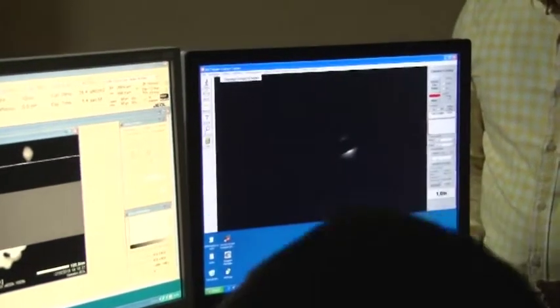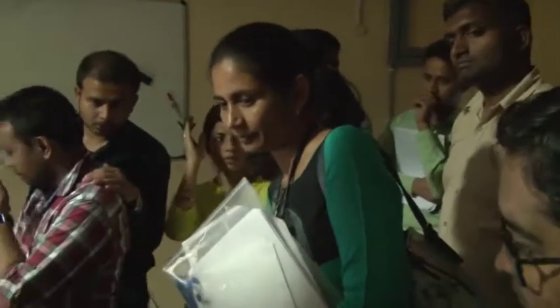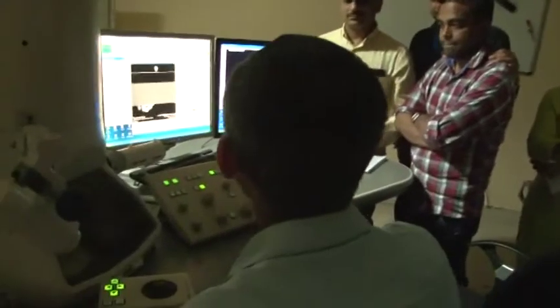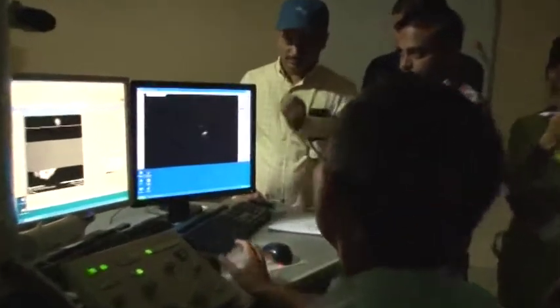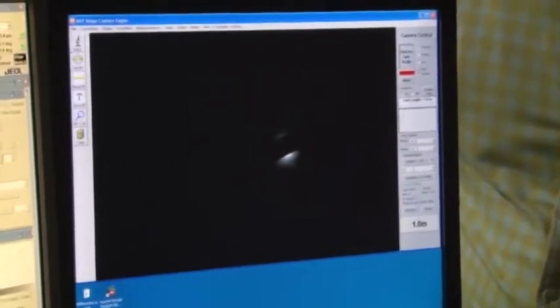What we are trying is changing the camera length to see its effect. The diffraction pattern should become bigger when we use a bigger camera length. That is the camera length shown here. Yeah, and it should change here also, but I think it just didn't. So maybe the camera length is too wide.